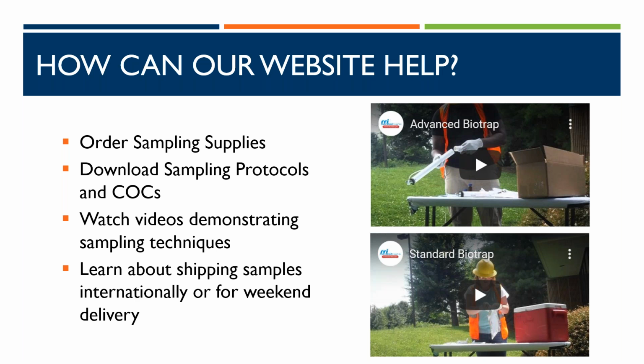We do accept and process samples on Saturdays so that the short hold time is met, but we have a different delivery address, so we can go pick up the samples from our local FedEx first thing that morning, and there's no delay in starting the extractions.